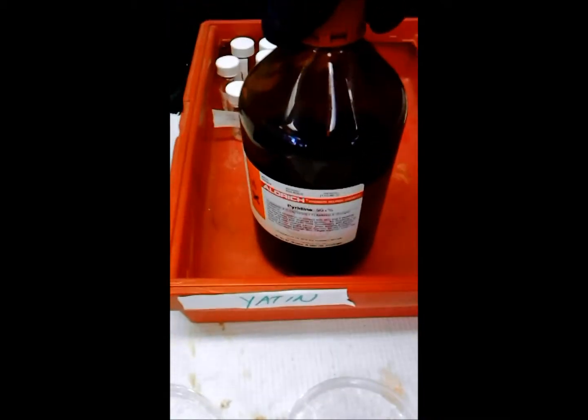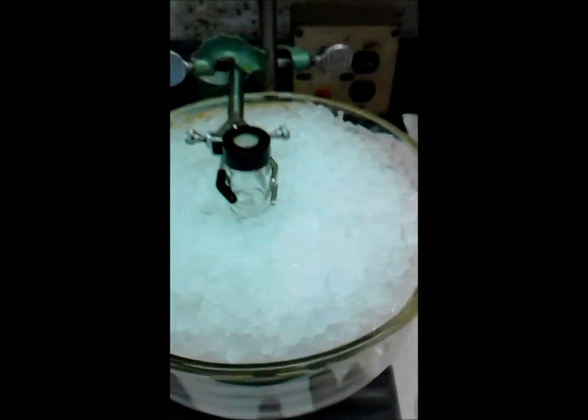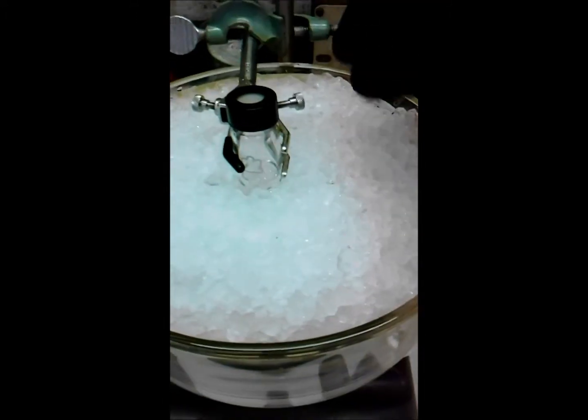We're going to be using pyridine as a catalyst and heptanoyl chloride as our acyl halide. The reaction is going to be carried out in DCM on ice.